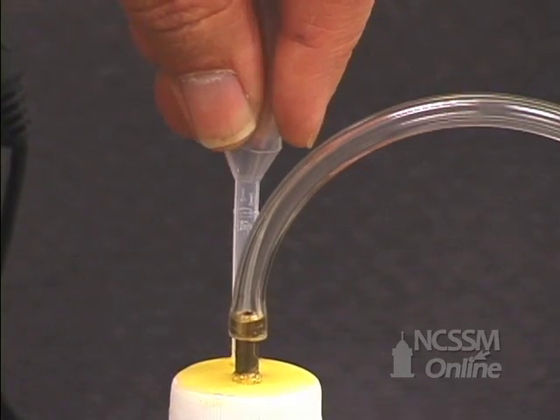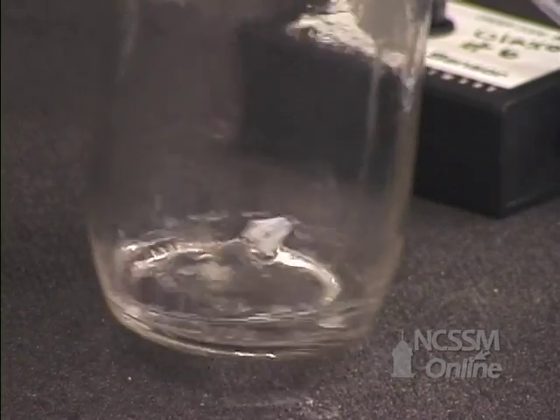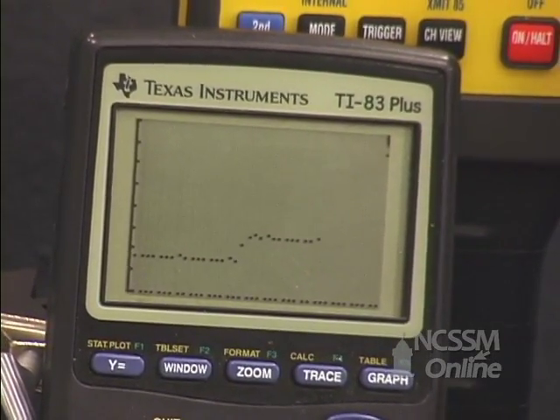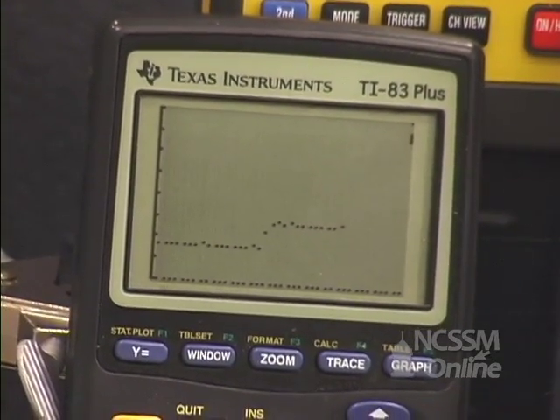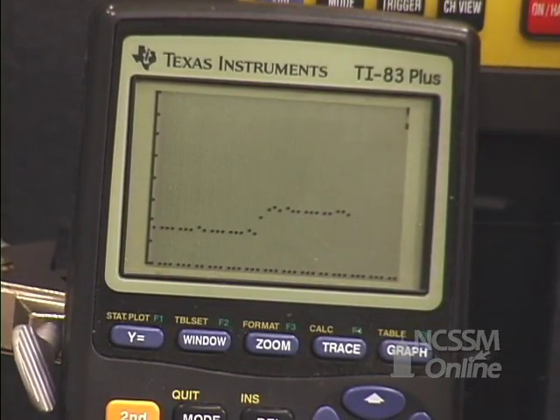We will then squeeze the bulb and inject all the methanol. We'll swirl this a little bit to help the methanol evaporate. The pressure probe is reading the pressure and the increase in pressure due to the evaporation of the methanol.